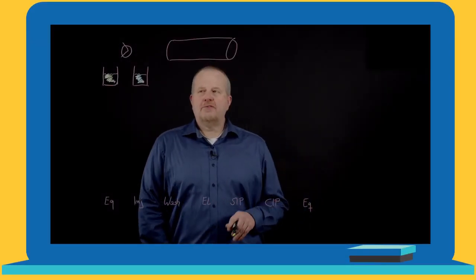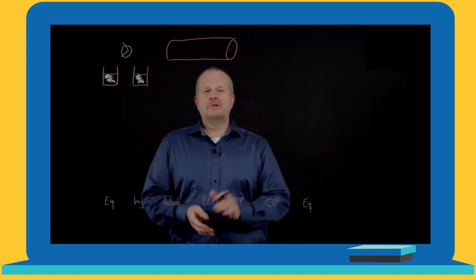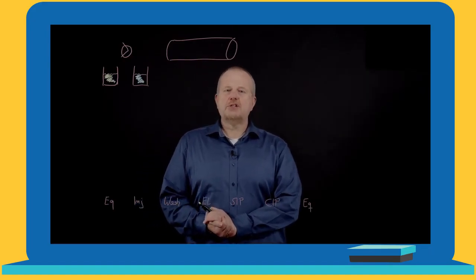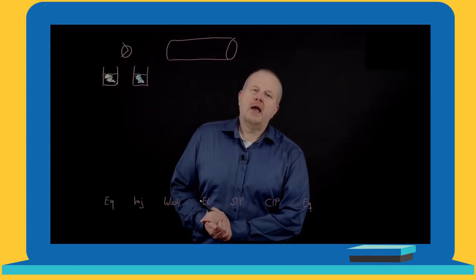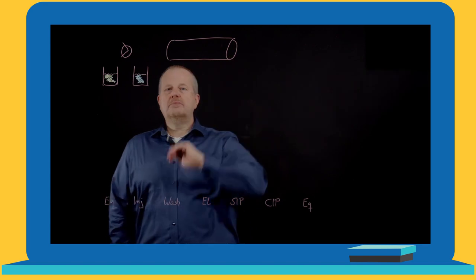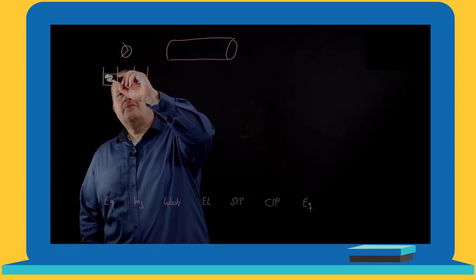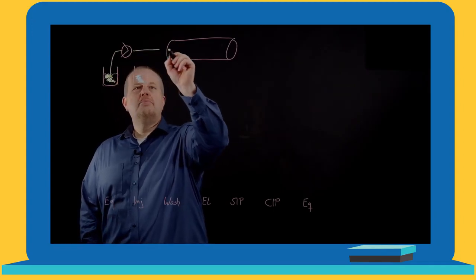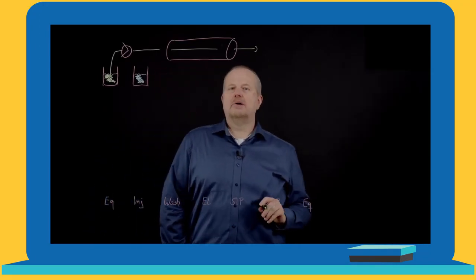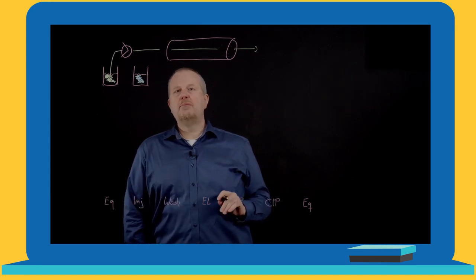So in the third part of our video, we come now to a real preparative separation, and we will set up something which you will use as the preparative separation of a compound of interest. Everything we have done so far was a quite easy system. So we had a column, and you know now what's in this column. We had a mobile phase, and this mobile phase was pumped through a pump, through the column, and here we collected our compound. But we never changed the composition of our mobile phase.